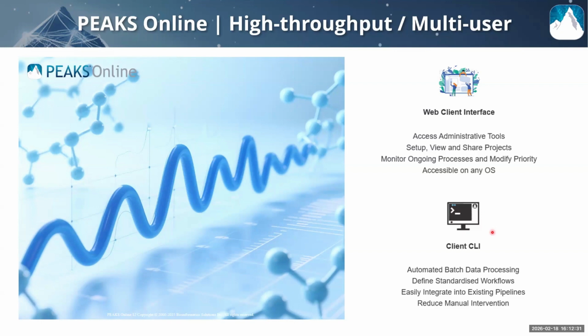So the user will essentially define the analysis parameters in a text configuration file, and Peaks Online will automatically retrieve the data from a particular drive, run the analysis based off those predefined parameters, and you can set specific exports for whatever result you may be looking for. And this really enables fully automated hands-off data processing for a high throughput environment, reducing manual intervention.